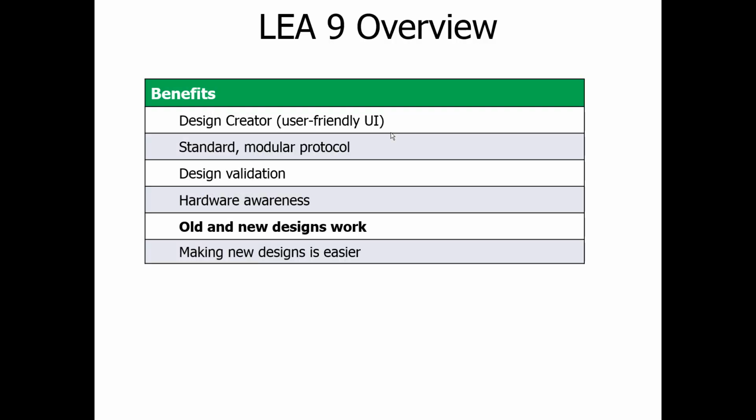So what I hope I've shown you today are the advantages of LEA 9 and Design Creator, which is a more user-friendly UI. We have a standard modular protocol that goes behind this, so new systems will have a simplified or standardized protocol to improve the ability to train people and to work on your system. Designs created are validated as they go through. You are specific to the hardware on your system. And you can see that making new designs is easier and quicker to pick up with Design Creator.